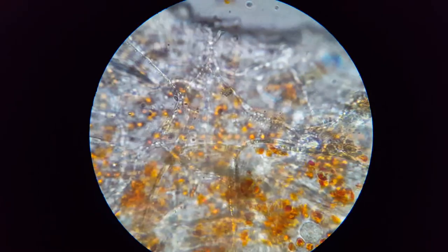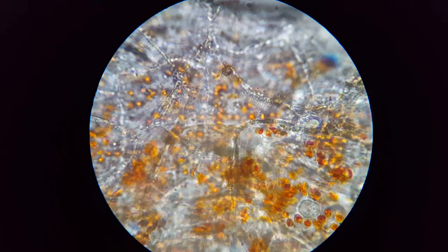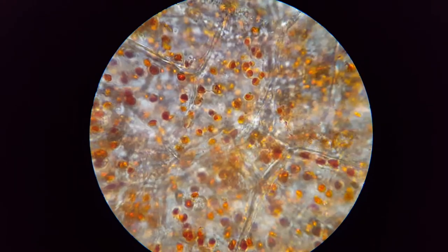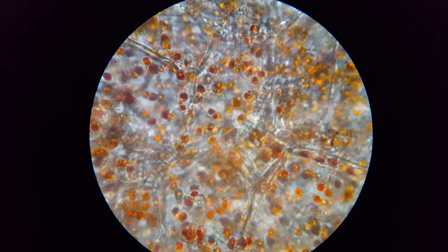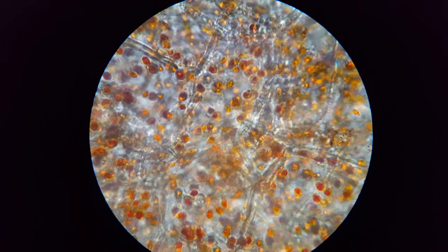I'm turning the fine focus and I'm not really getting any serious change, but that's mostly in focus. You can see where these cells are, where the cell walls are, and you can see where the color organelles are — the red things. They're probably called chromoplasts. And so that's 1,000x magnification using the 100x objective under oil. And that's a skin of a red pepper.